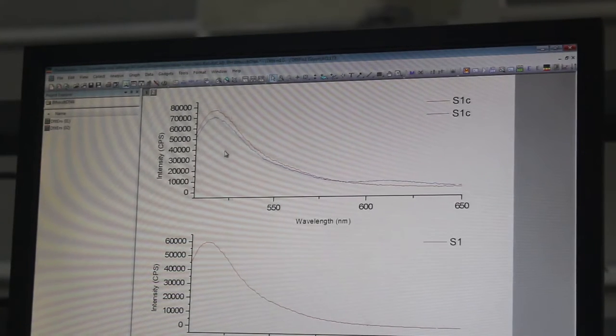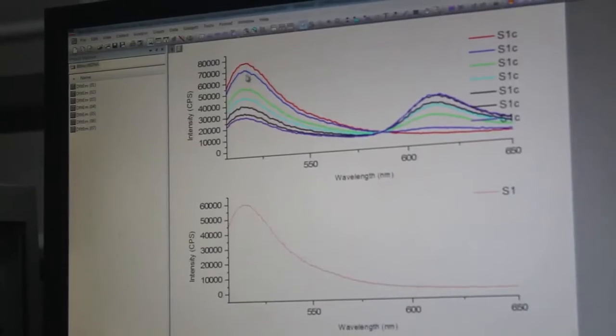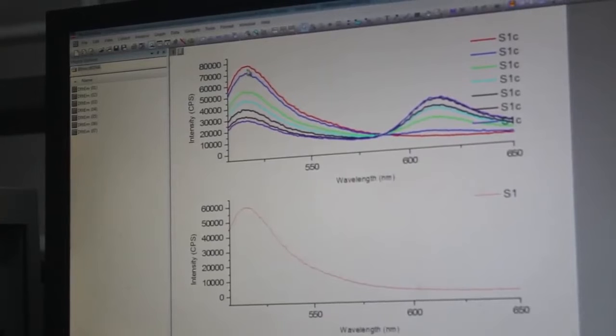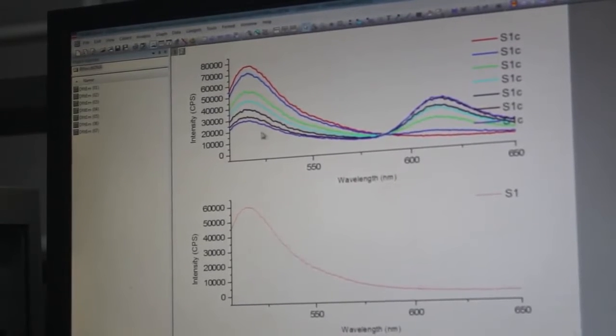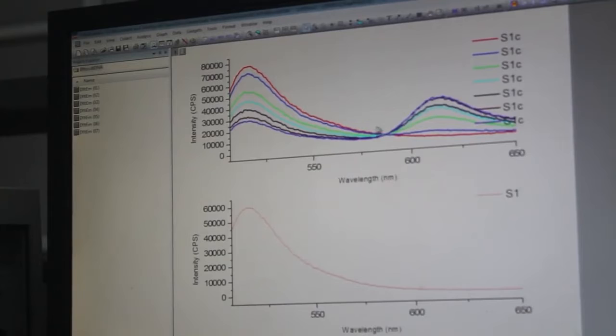This way we will continue until saturation. We have seen a very nice pattern of decreasing donor intensity and increasing acceptor intensity, but now it seems it has reached saturation.